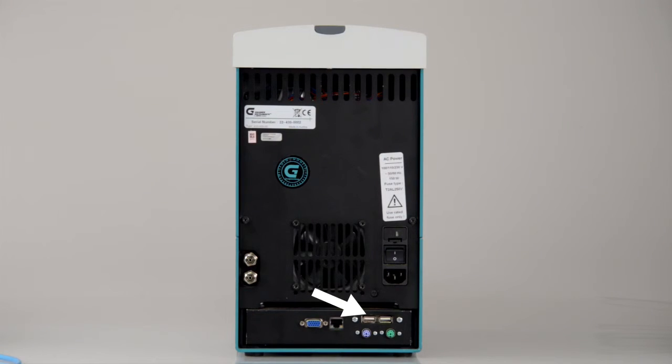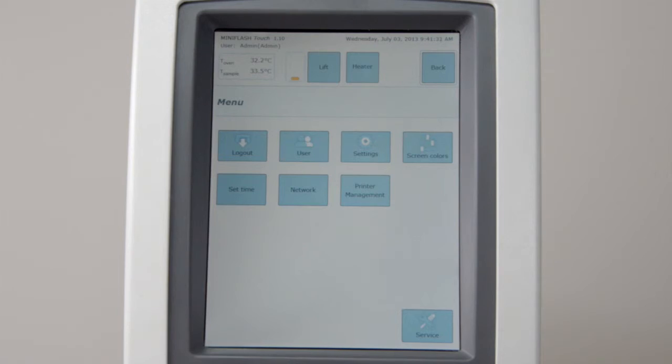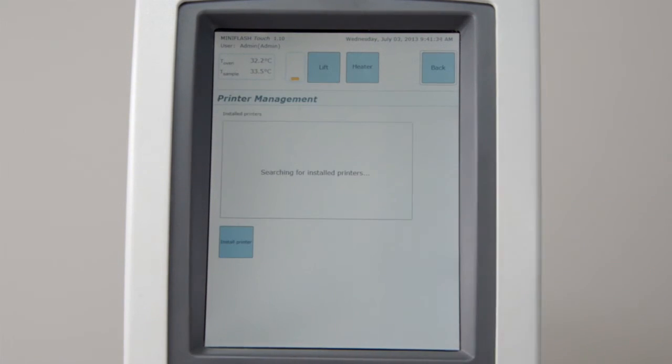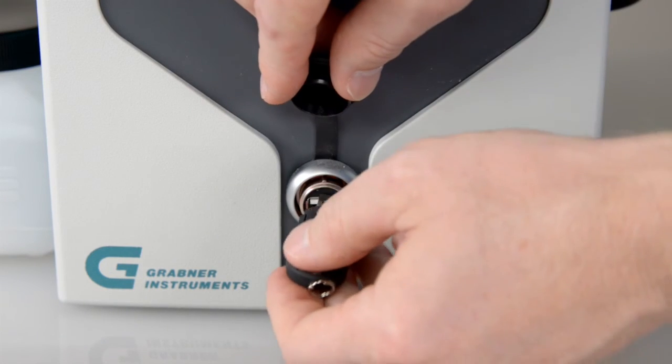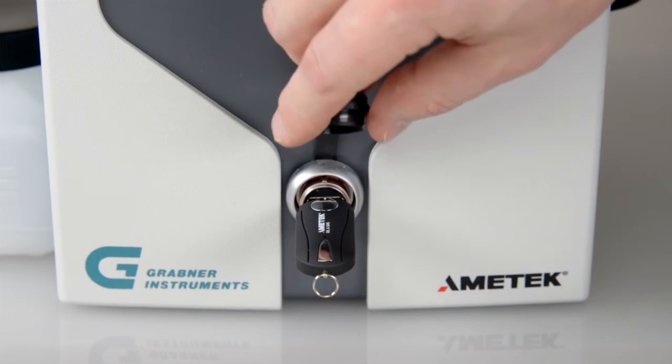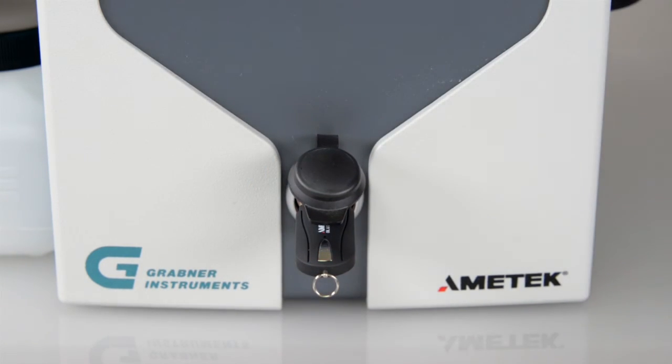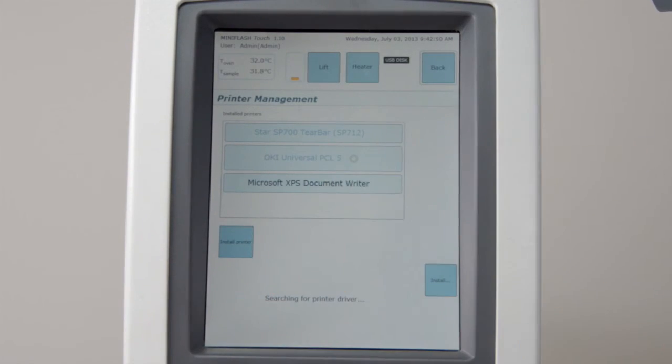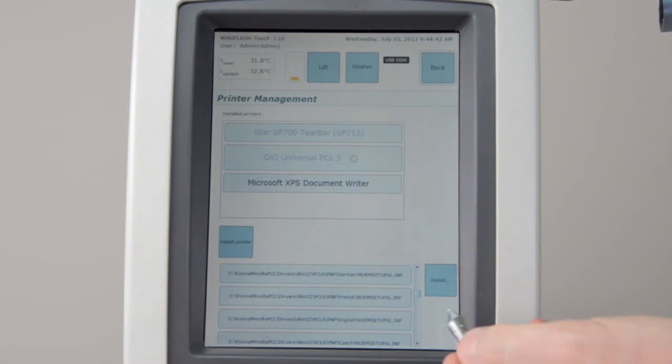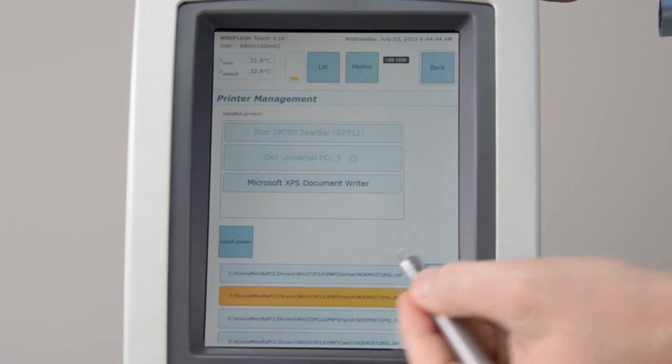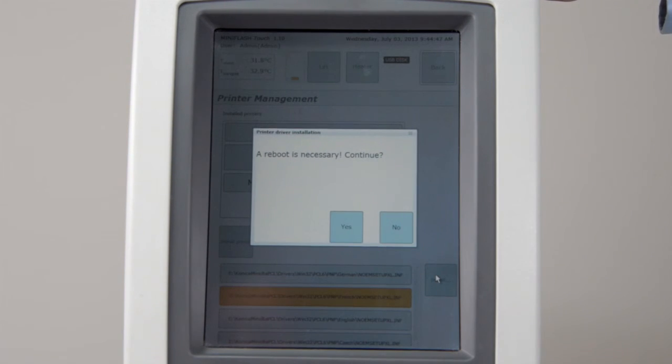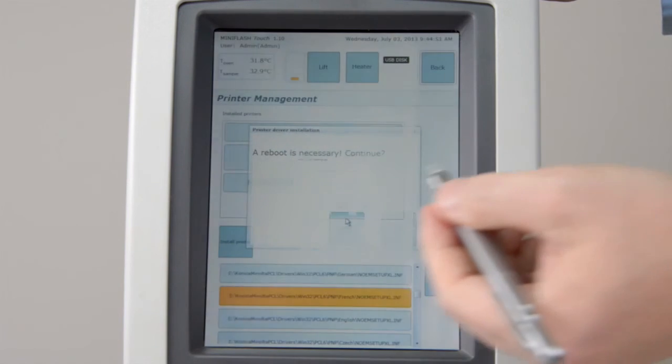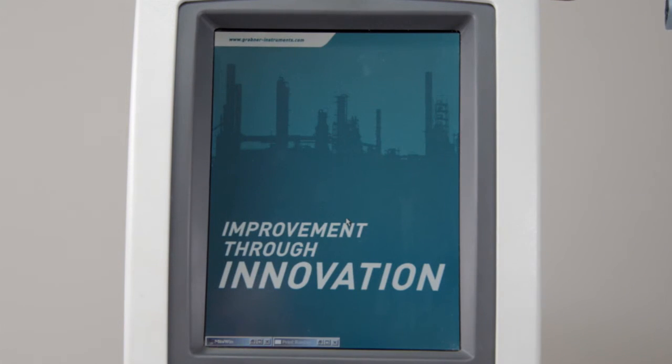Connect the printer to a USB port on the Mini Flash Touch. Go to Menu, Printer Management. Connect the USB device to the front USB port. Select Install Printer. Select the printer file and press Install. Follow the installation instructions on the screen. For network printer installation, please consult the manual.